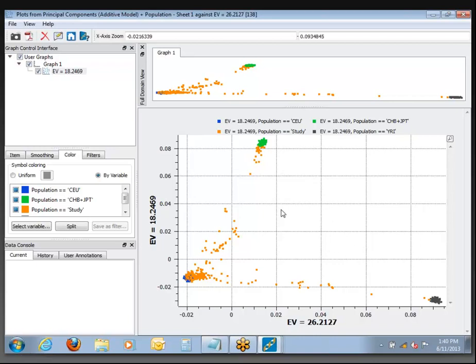Now we can look at this and see more readily what's going on. Blue is our HapMap European reference group, green is our HapMap Asian reference group, gray is our HapMap African group. What we're seeing in orange — the study subjects — they're mostly grouping together with European. While samples along this axis are most likely African Americans, usually following a continuum between European and African. We have Asians up here, and right in this area that's typically where we see Hispanic or Native American or Latino populations.